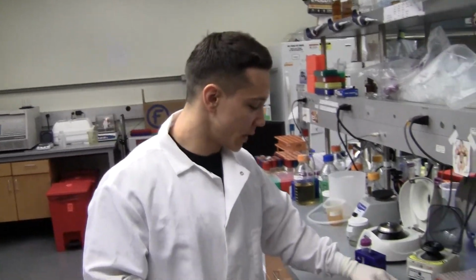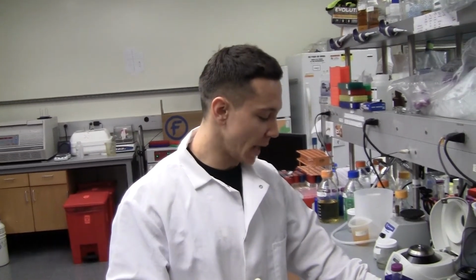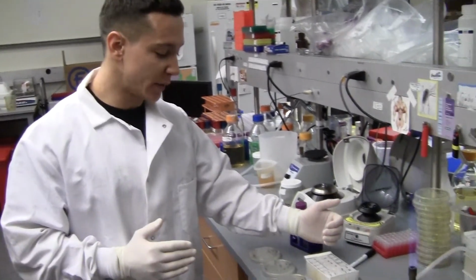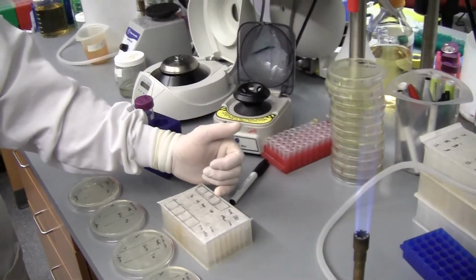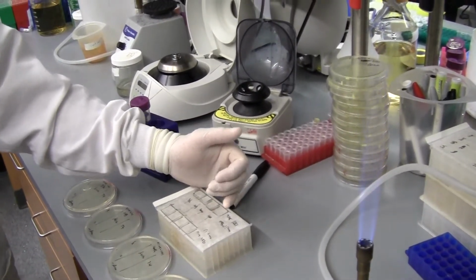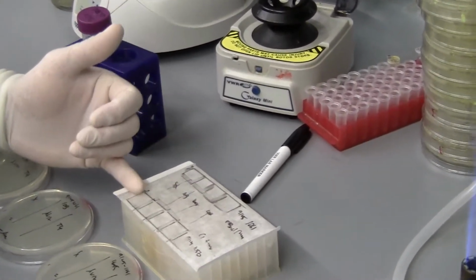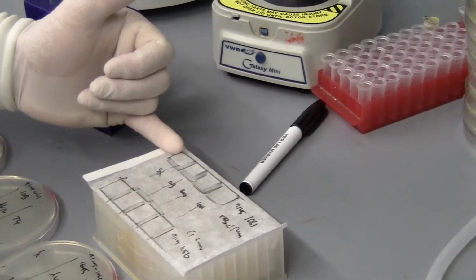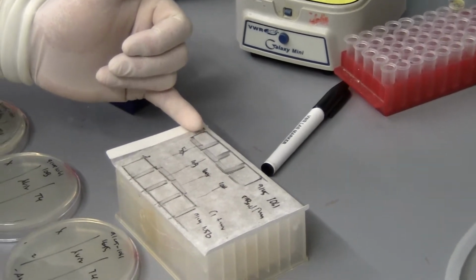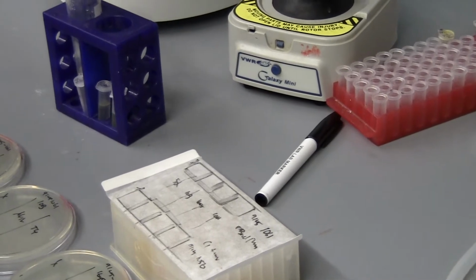So the experiment we're going to be doing today, again, is we're going to be titering phages. I mentioned earlier that we have different strains of E. coli. We have DH5 alpha, DH10B, MG1655, and MC1061. And in these four different strains, I put in two different plasmids. This set of four has a plasmid that has an inducible IM gene. The IM gene is a protein from phage T4 that is a periplasmic protease.